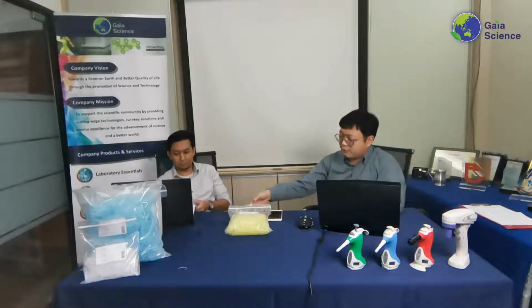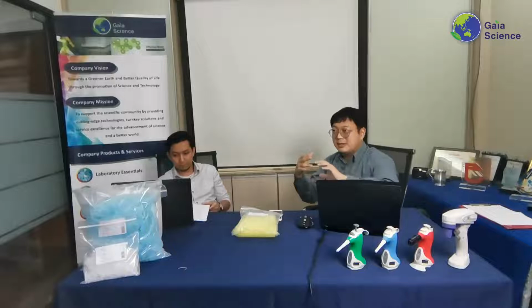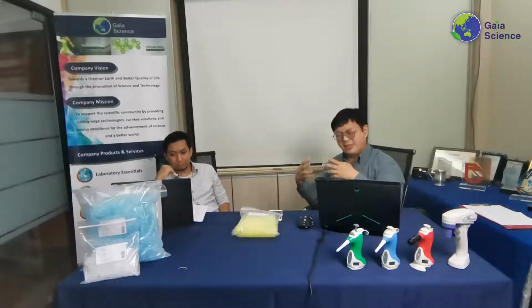Okay. Normally, bulk tips are non-sterile. That's because if you pack them like this and you open it up, every single tip has already had its sterility compromised, I would say. So those who are very concerned about how sterile it is will go with racked tips instead.